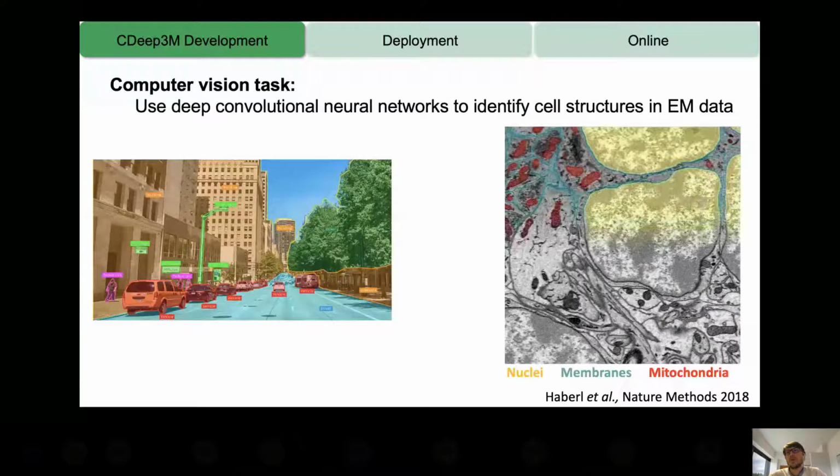As many before me obviously already noticed, doing this is really a machine learning task. Humanly not possible anymore, and we can build on developments in the industry that segment images, for example, for automobiles or for other purposes.